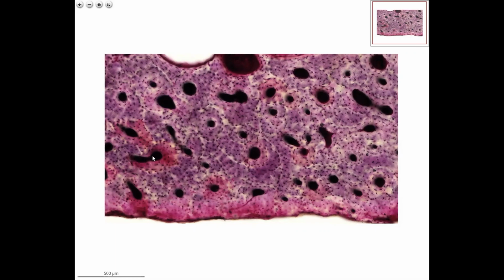Two Haversian canals may be cross-connected with the so-called Volkmann canals. The Haversian canals and the Volkmann canals are actually a system of tubelets within the bone which drive the blood vessels to the middle of the osteon, like here, or they connect two neighboring osteons with each other.